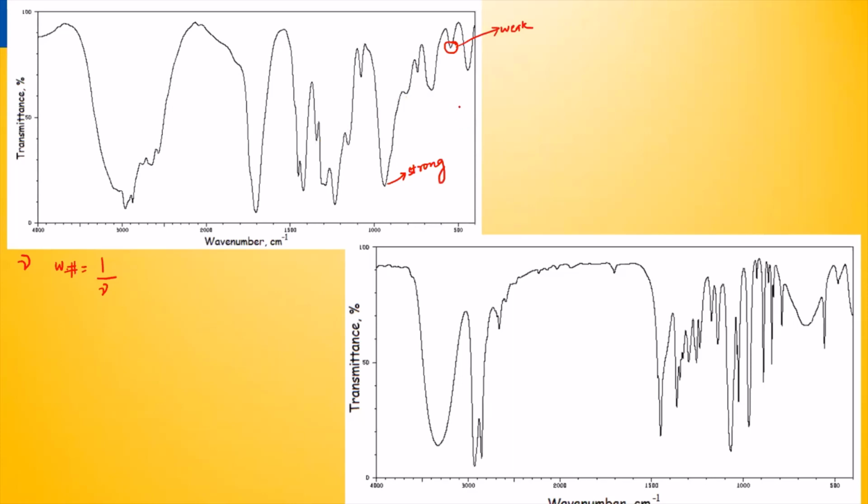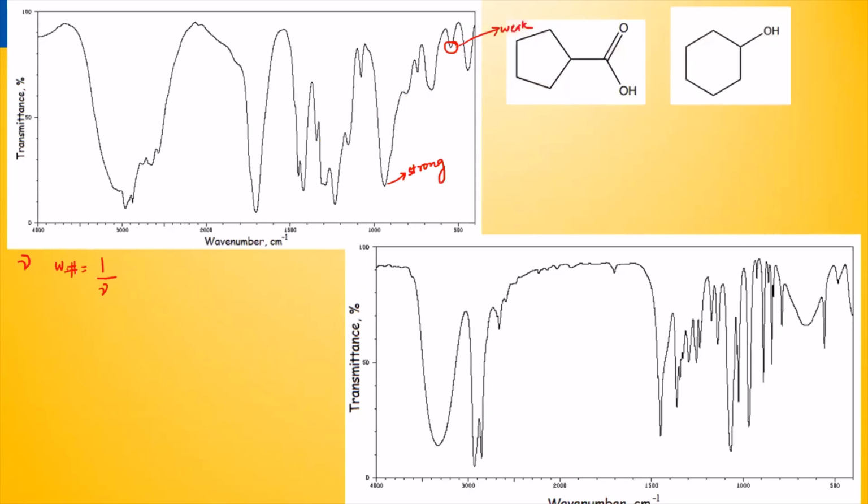So when I give you a spectrum, don't get flustered and start looking everywhere in the graph, because then it defeats the purpose of the tool. You have 2 groups. All you've got to do first is have the table in front of you and find out what major strong peaks you have. I'm going to mark this as 1 and 2.